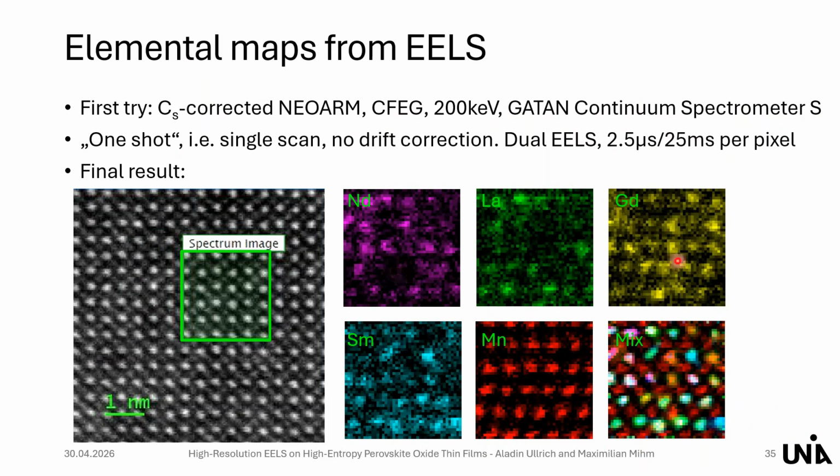And yeah, since we couldn't apply any kind of drift correction here, and also when you repeat the measurement, you're never sure whether you end up at the same place or maybe a few lattice sites off. We couldn't prove this in this way. And also, when you scan for a longer time at the same place, then you see actually that the sample starts to decompose and to get destroyed.